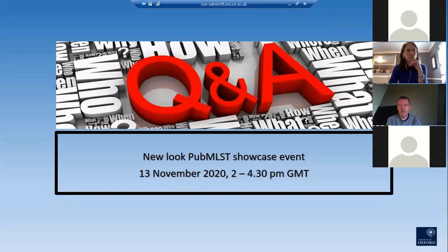A lot of that is trying to improve metadata completion and validation, so that sometimes you can't put a record in where you've got contradictory information in the field. That work is still underway. The main part of BigsDB that has changed is really only the interface. The actual functionality hasn't changed with this redesign, but we are constantly developing new functionality to improve curation.